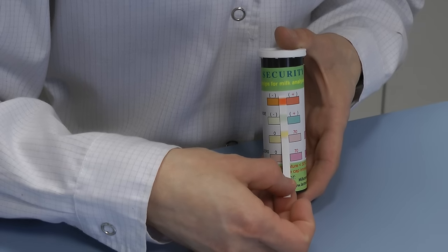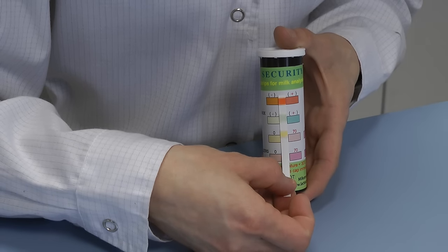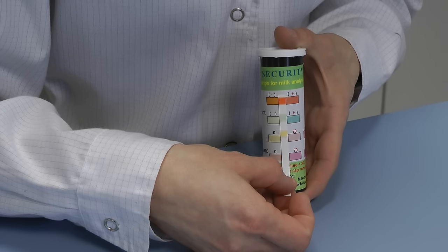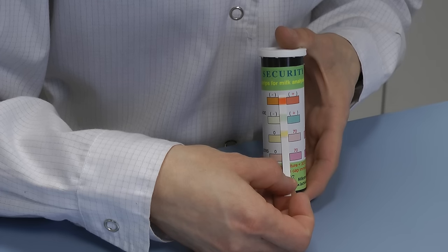When there is adulteration with neutralizers, the first indication area is changing its color from orange to orange-red.